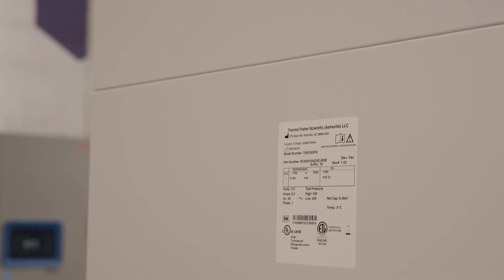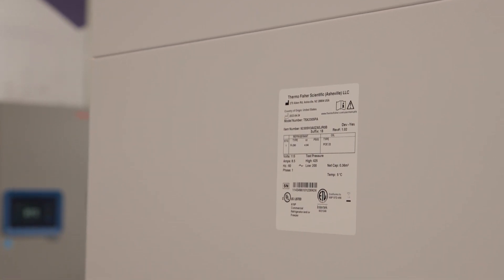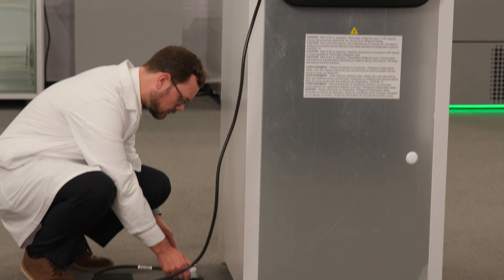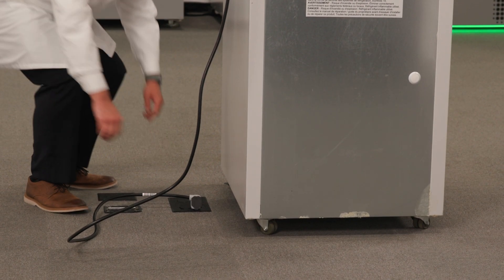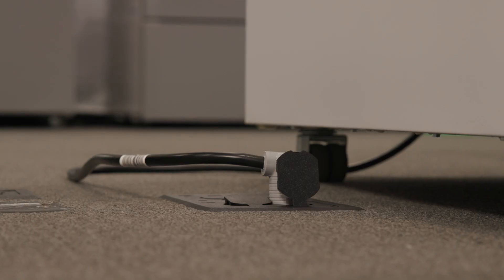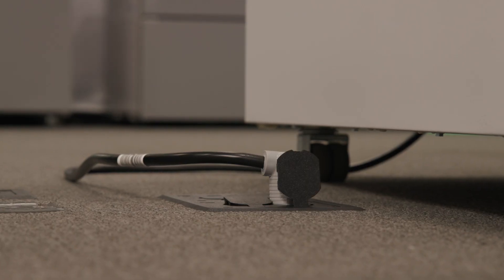Verify the electrical requirements as shown on the data label, which is located on the left side of the unit towards the top of the cabinet. Confirm that the dedicated circuit available to power the unit is less than 10 feet from the refrigerator and matches the voltage, breaker amperage, and other specifications.